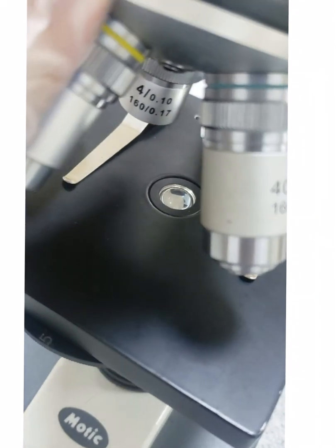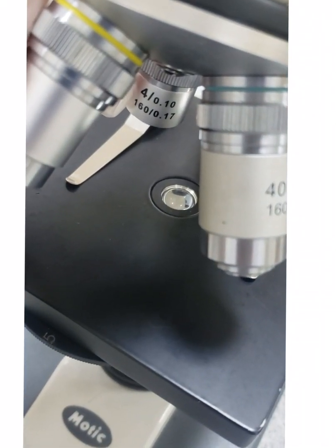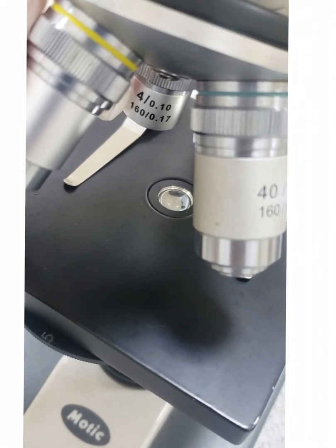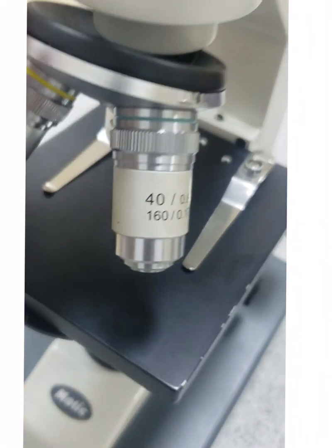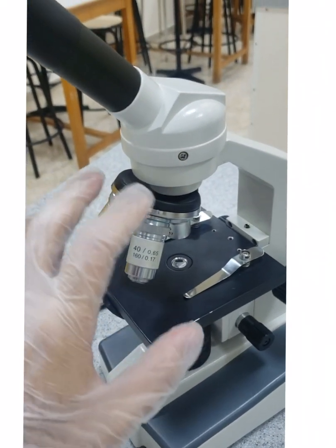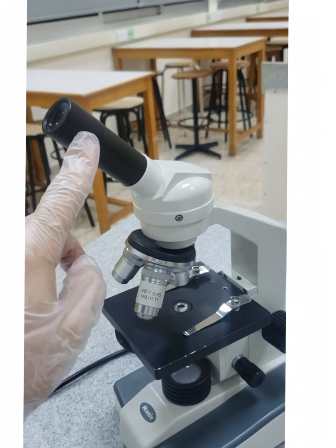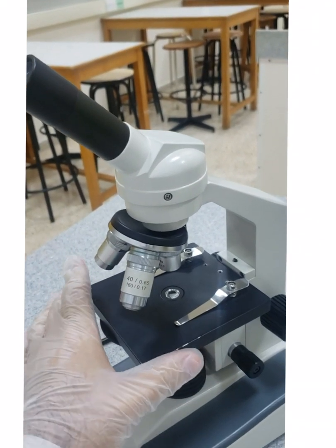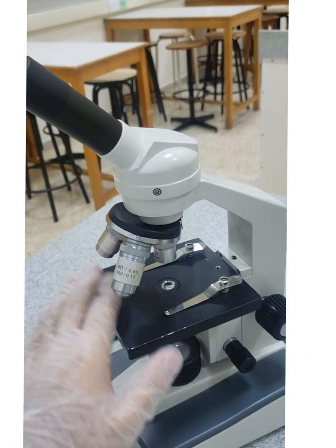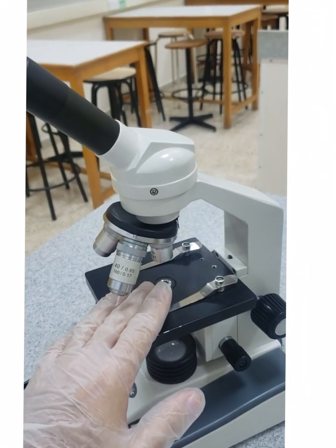This is the least powered one, it has magnification 4 times. So these are the objectives, the lenses, in addition to the eyepiece lens. Don't forget this lens, guys. Through these objectives I will observe the object or the specimen I have on this slide.